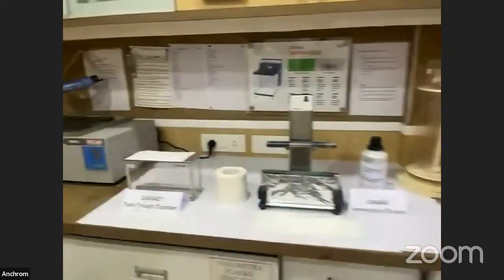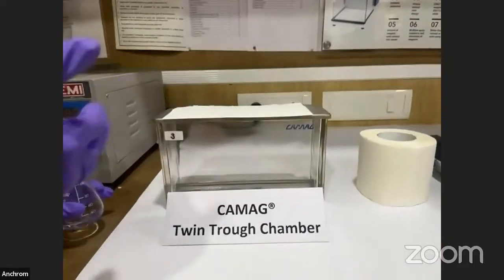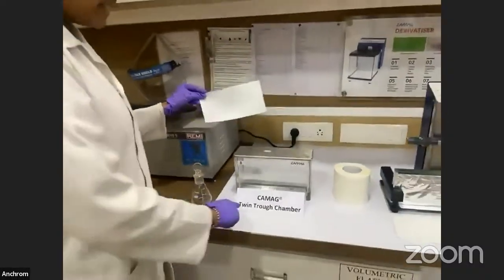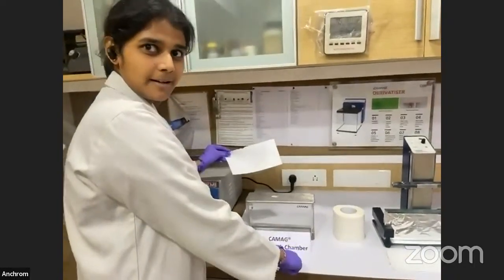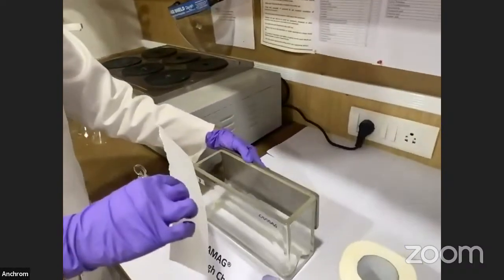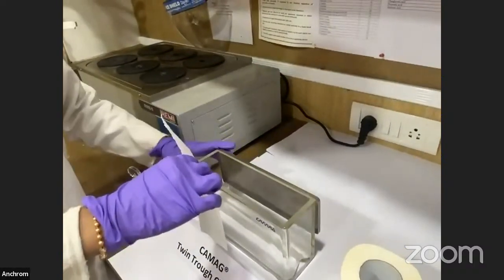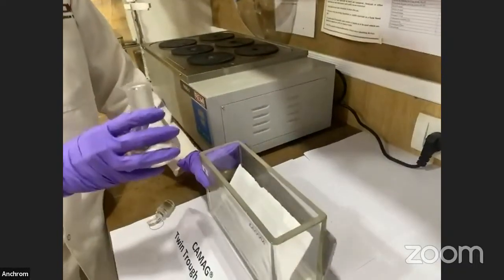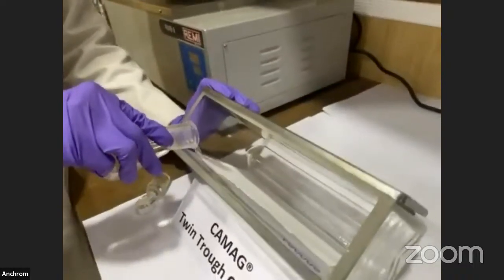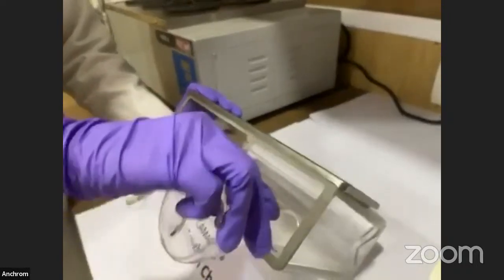So after preparation of the mobile phase, now we'll keep the chamber for saturation. So this is the saturation pad. This is the CAMAG twin trough chamber. You have to pour 20 ml of mobile phase in the front side.